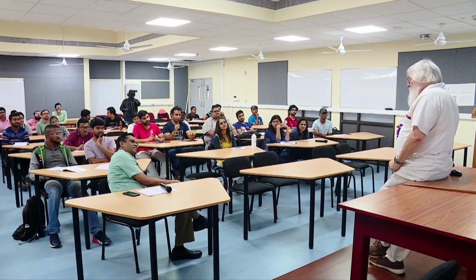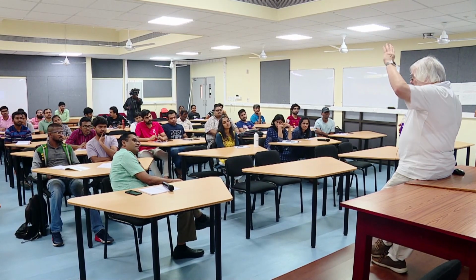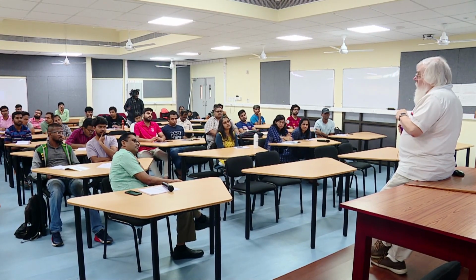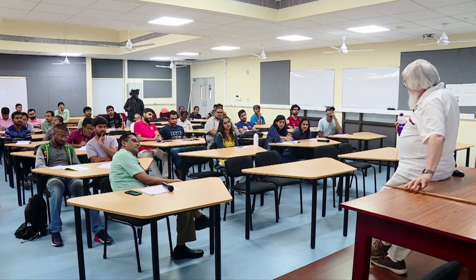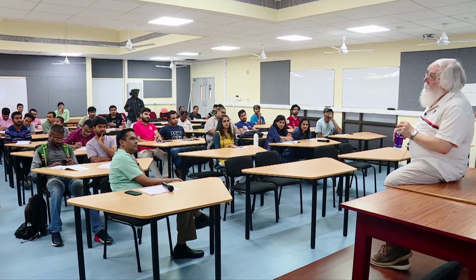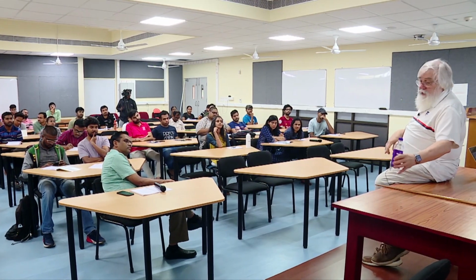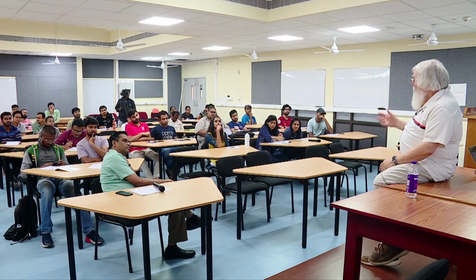When we come back, we're done talking about the instrument. So what did we talk about today? We talked about the electron sources. We talked about the lenses. We talked about aberrations in the lenses. We talked about the functions of apertures. We talked about beam control, stigmators, how to adjust stigmatism, how to adjust focus, how to recognize when you're in focus, and how you recognize when you have an astigmatic image. We now talked about the functionality of the instrument.